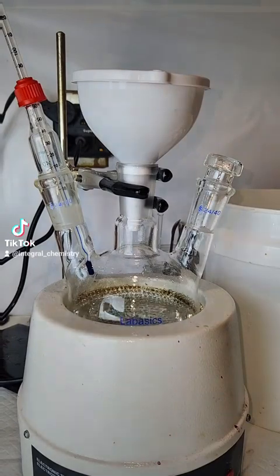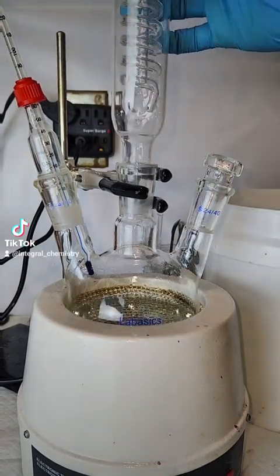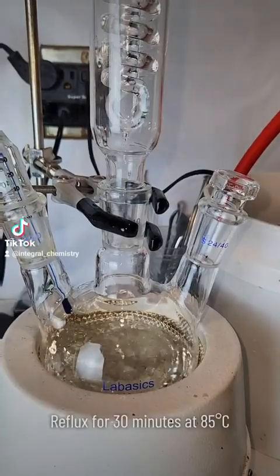Once the addition is complete, I add my mixture to a three-neck boiling flask and attach a reflux condenser. The condenser is filled with ice-cold water, and I allow my mixture to reflux at 85 degrees Celsius for around 30 minutes.